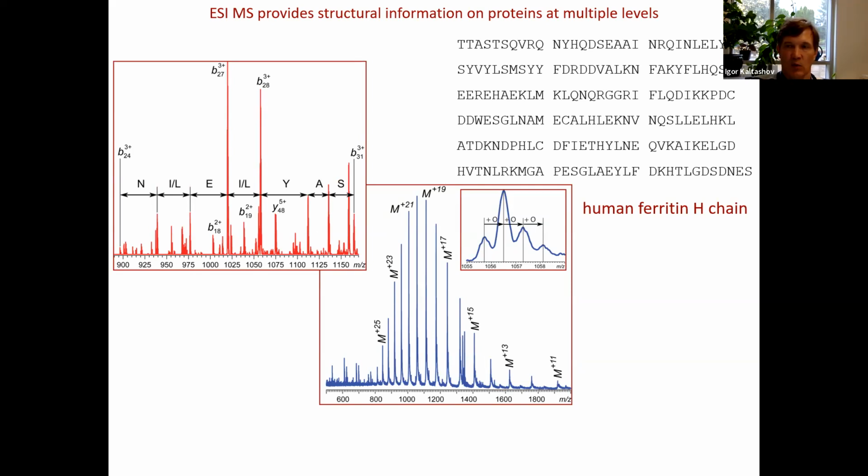But an interesting thing that we haven't discussed so far, and I want to show it now, is that if you go again to the level of the intact protein, and you decide to reacquire this spectrum, but now instead of using denaturing conditions, which we typically use in mass spec, so it would be a water-methanol or water-acetonitrile mixture with a little bit of either acetic acid or formic acid added, you try to use a solvent that is a better representation of the native environment.